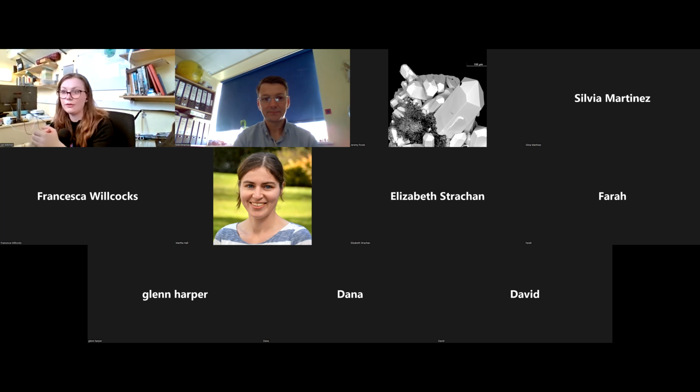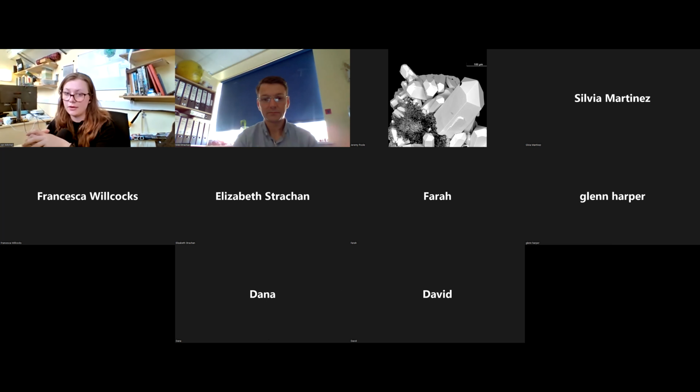Yeah, so we use a series of MAC standard blocks, Microanalysis Consultants, based up in Coventry. So we have a couple of custom made blocks from them. Typically, I think the 37 block is one of the standard ones. You can get that from a couple of different suppliers. MAC are local and they are pretty well priced. A 37 block should contain pretty much everything you could possibly ever want to come across.